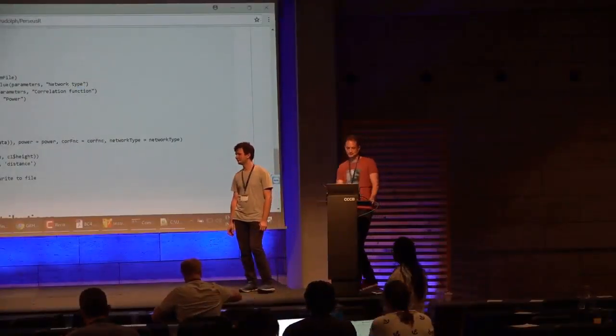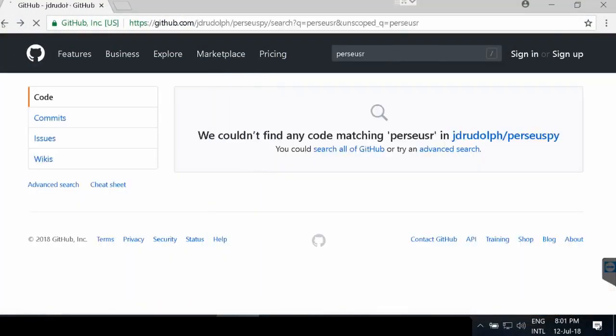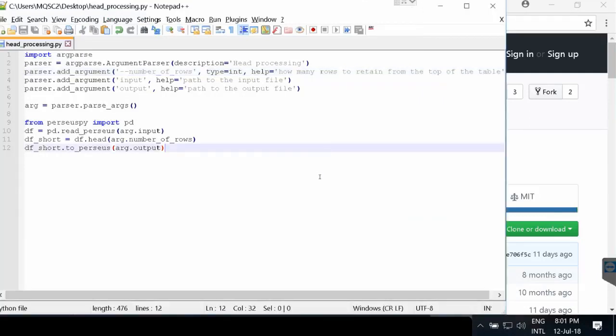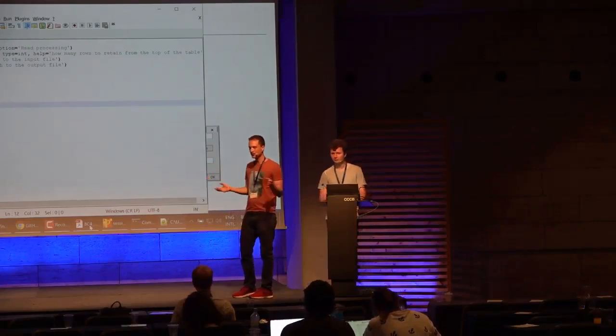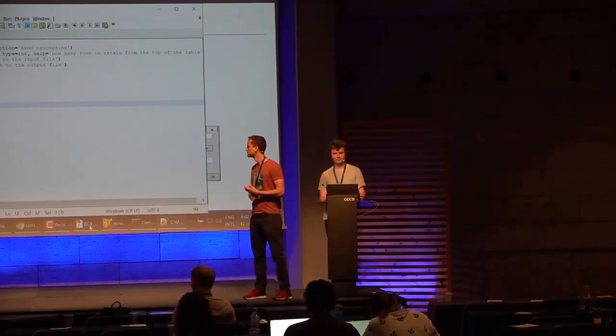Okay. Can you go back to the Python code, please? Which part do you mean? The file Notepad. Yes. So I think the output file should always be some kind of data frame. Is this right? Yeah. Perseus basically expects that what you will provide as an output will be a matrix in the Perseus format. And that's exactly why I implemented this Python code, so you don't have to worry about these things. If you stay within the land of reasonable Python programmers that use pandas, then you will have this convenience function that will just write it in a correct way.